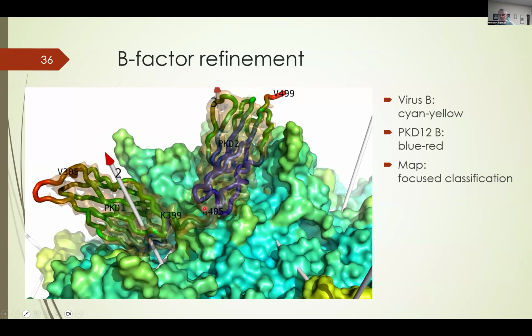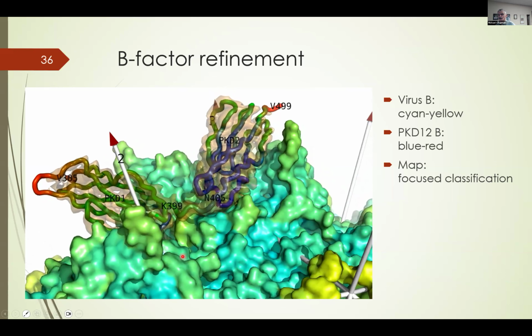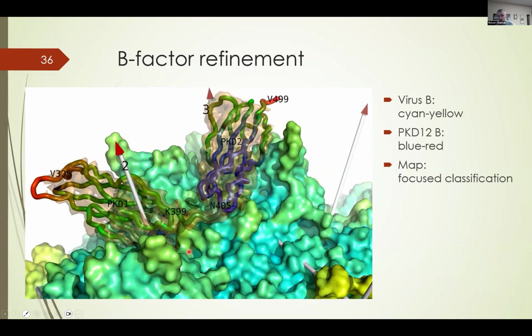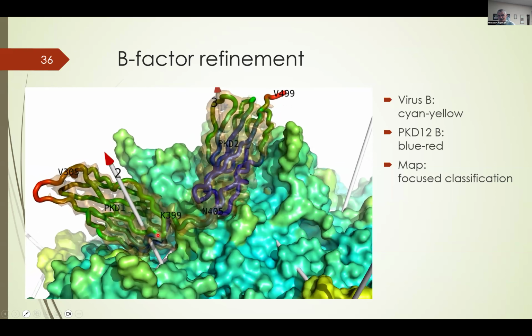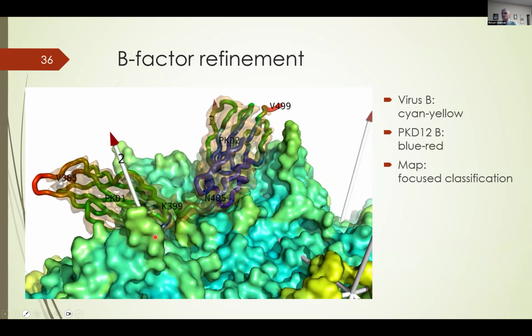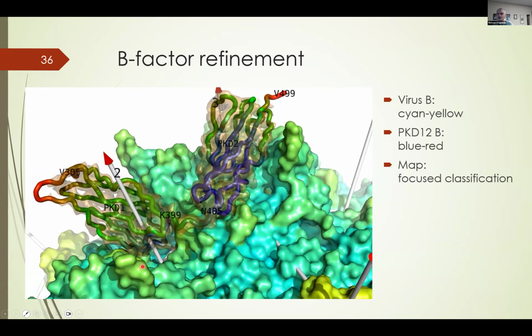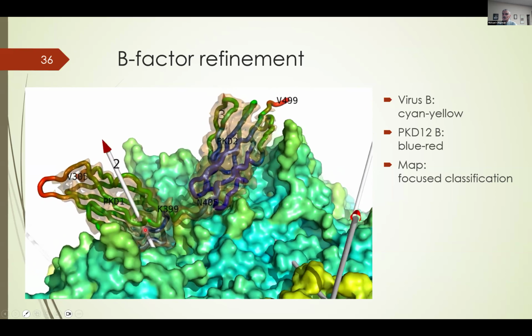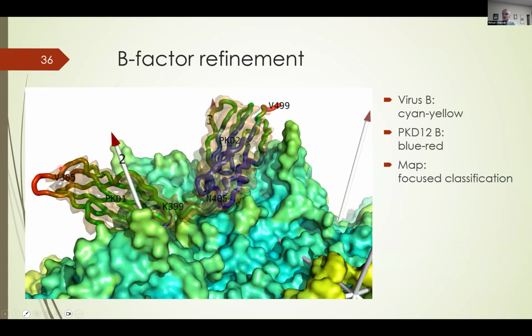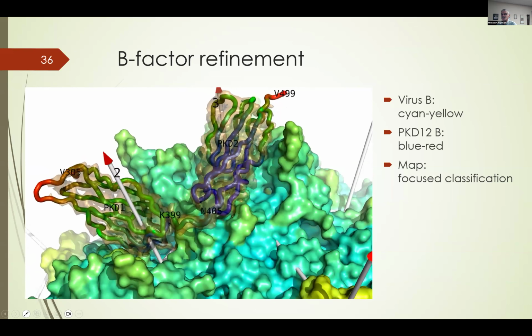Now, if we go to the previously unseen PKD1, there is also a very small region in here you might or might not be able to see of blue residues, where it's most closely associated with the virus, but then an even more noticeable decrease to higher disorder the further you get away from that site.